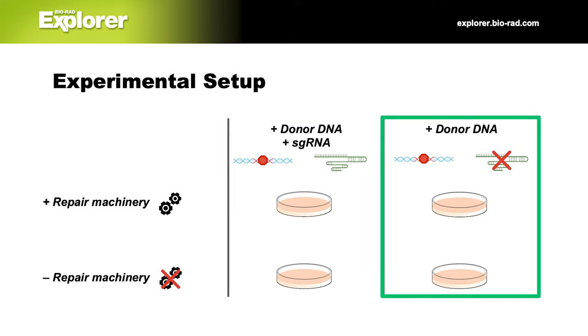Add 10 microliters of the PD plasmid to the A tube. Flick the tube a few times to mix and put it back on ice. Change tips and add 10 microliters of PD to the C tube. Pipette up and down or flick the tube to mix, and then put the tube back on ice.